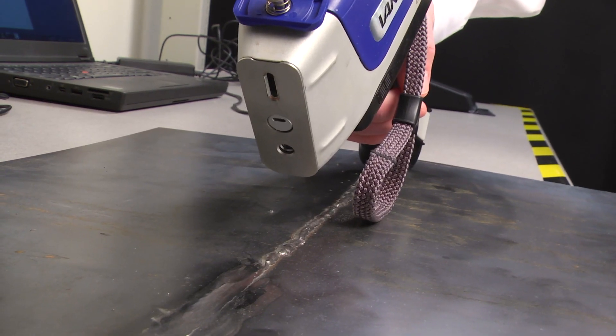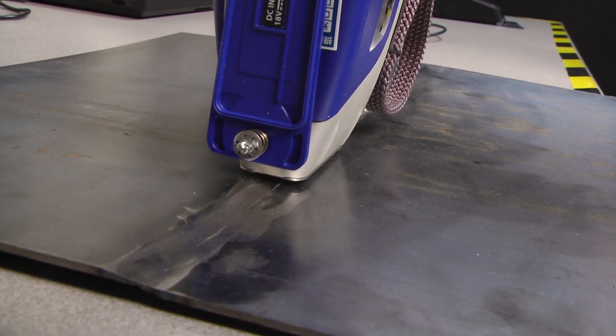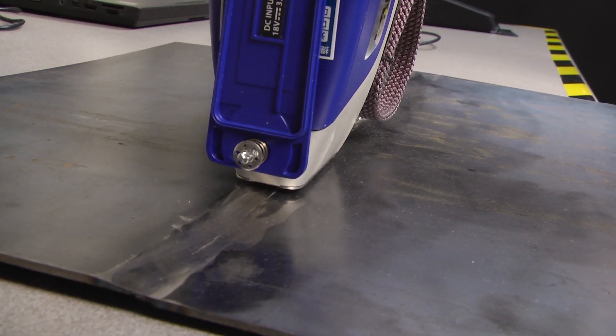The reason that we have separate libraries for welding as well as grade matching is that weld material is generally specified in a different manner, in that most weld materials will have a higher alloying content than what the parent or base material does. So by selection of the welding grade library in addition to the normal grade library, we will account for any welding grades during analysis.